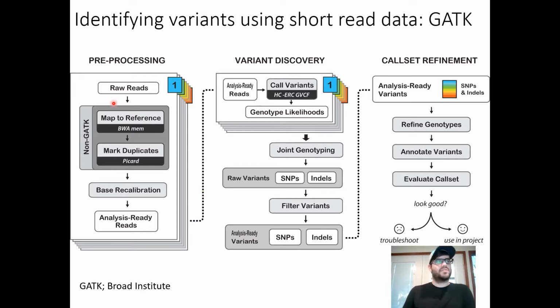And so the first step is aligning the reads to the genome. We would take our raw Illumina reads, quality filter them, and get rid of any adapters and any low quality base pairs. We could use a couple of different programs to map these reads to our reference genome. The most common, as we talked about, are BWA and Bowtie2. What these will produce is a BAM file that has the read itself, the exact positions that it aligns to the genome, and any differences between the reference and the genome line.